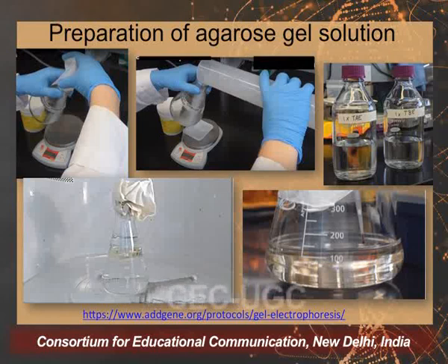Ethidium bromide stock is made 10 mg per ml and the working is 0.2 to 0.5 microgram per ml solution. So, while it is cooling, the ETBR can be added in here. Now, a very important precautionary method that needs to be taken, and the knowledge of it should be there, is that ethidium bromide is a very powerful mutagen. Therefore, the handling of ETBR should be very careful. One has to use the gloves, the lab coat, and in fact the goggles for using such a harmful chemical reagent. So ETBR can be added at this point.